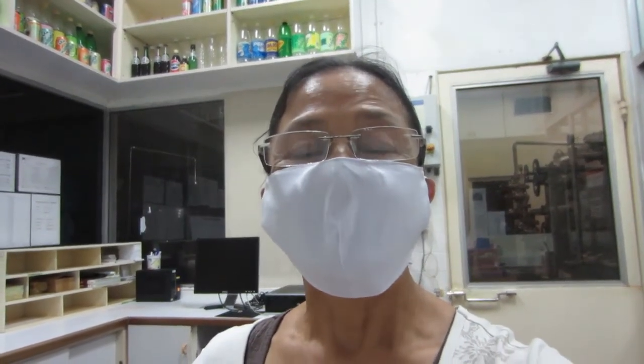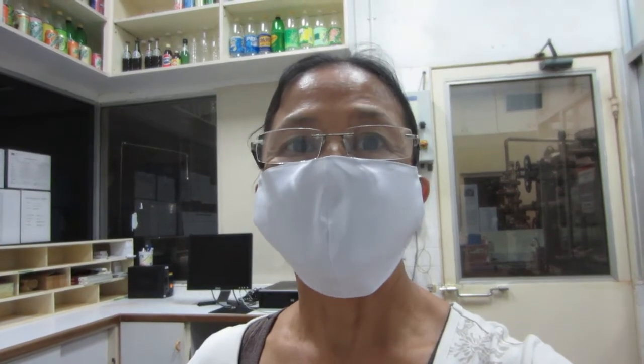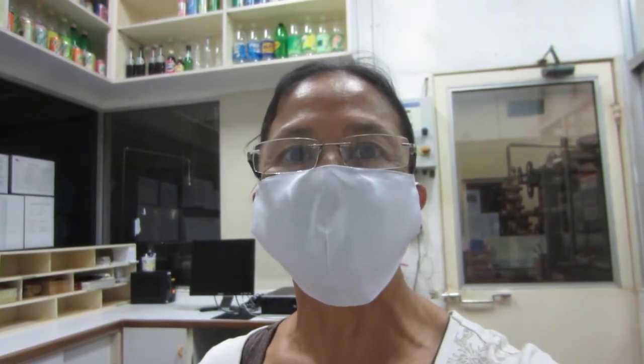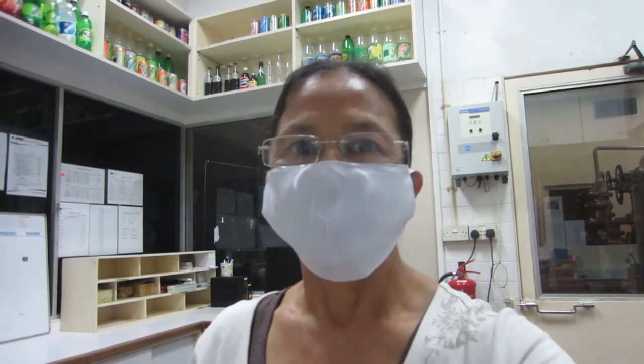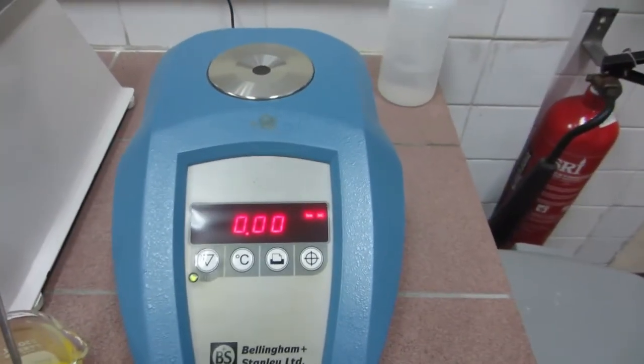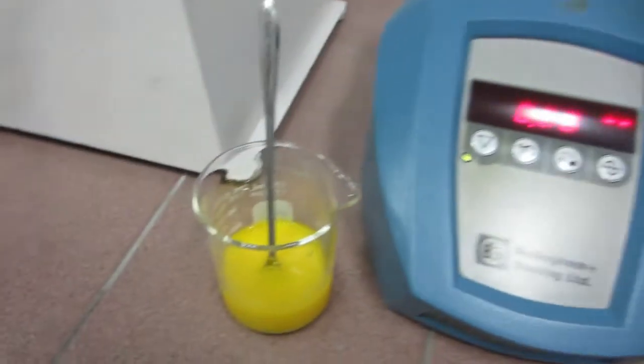Hello friends, welcome to my blog. Today's blog is knowledge power — a little bit of knowledge that I've learned from my work. It is called Brix. Brix is the sugar content of a certain liquid solution. I'll demonstrate it to you right now. I have here a certain liquid solution of beverage, and I'm going to check the sweetness of this solution through this Brix tester — it is called a refractometer.